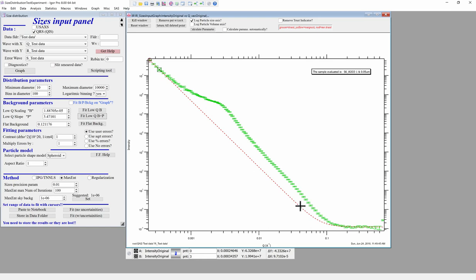There is going to be a difference in here, and what is correct strongly depends on what the source of the scattering at low Q is. If Porod's law is obeyed, then you need to force this to be 4, because that's Porod's law, and then just do a fit of the Porod constant. If that source is not a Porod, but possibly a surface fractal or something else, then you need to know what that something else is and fit it correctly in order to get correct data at high Q.